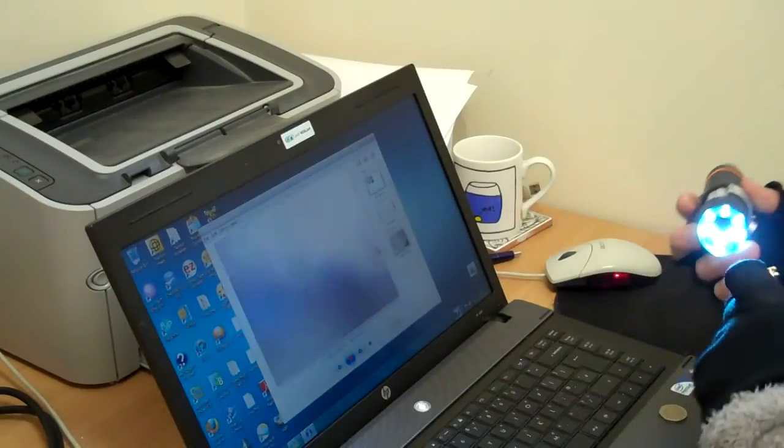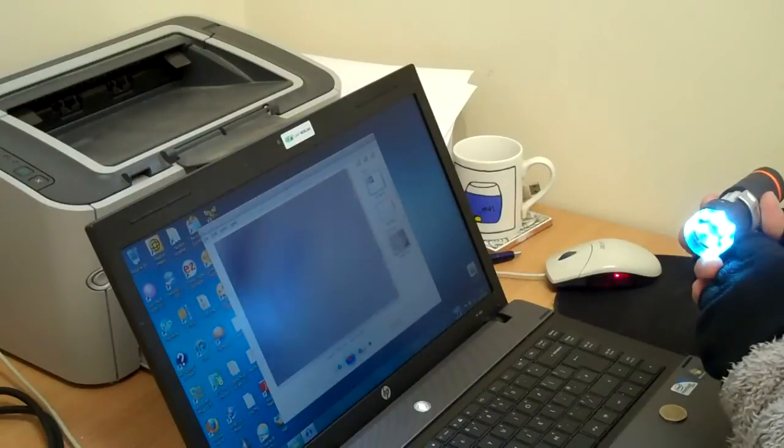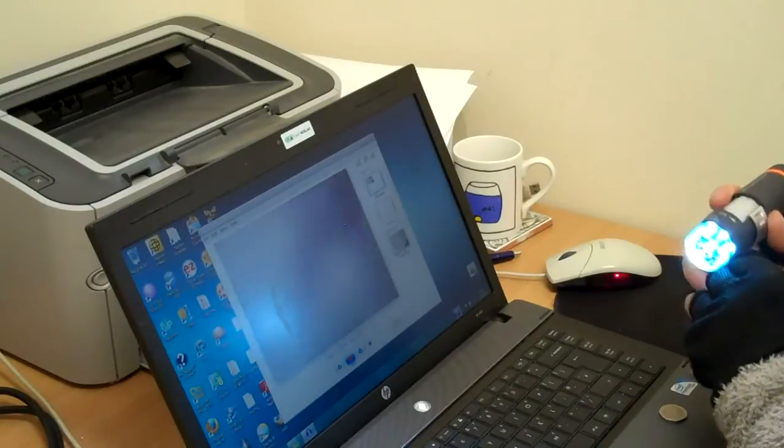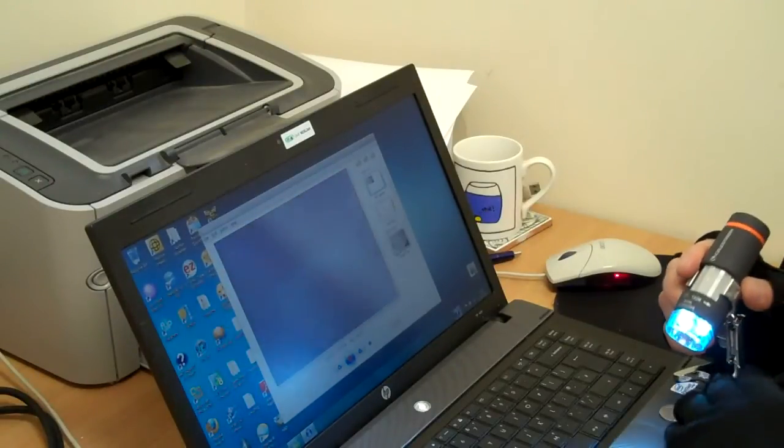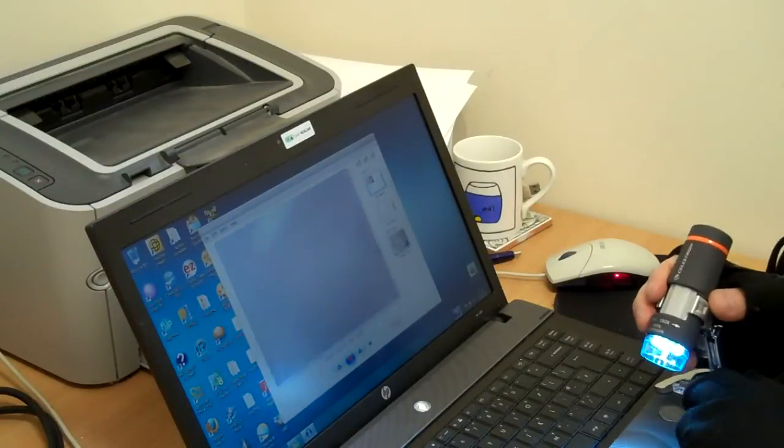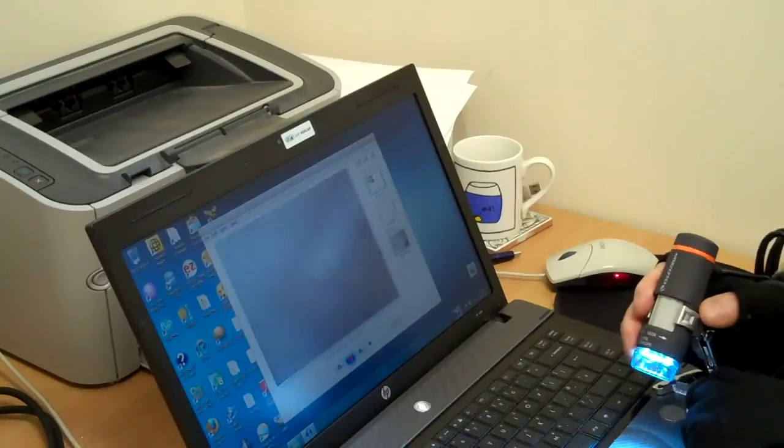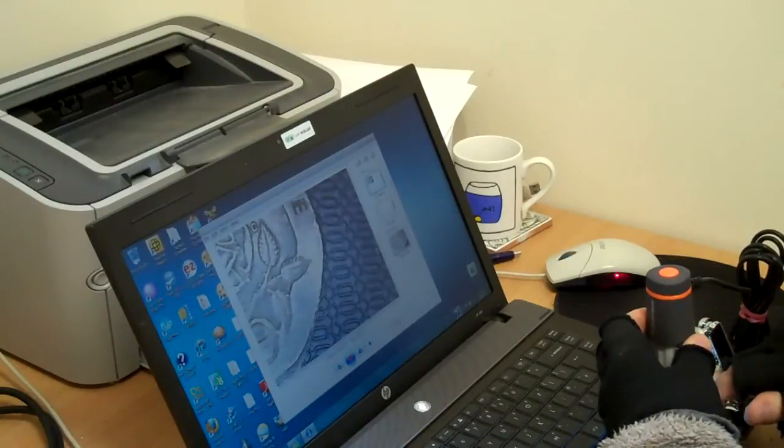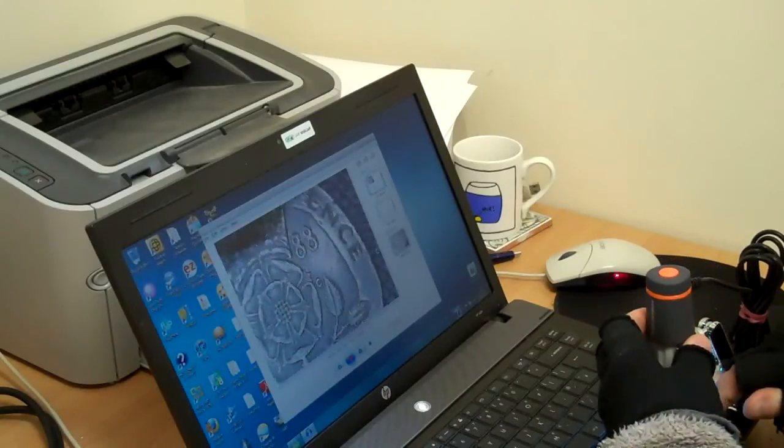If I don't want to hold it, I can fit it onto this stand that comes with it. There's the coin again.